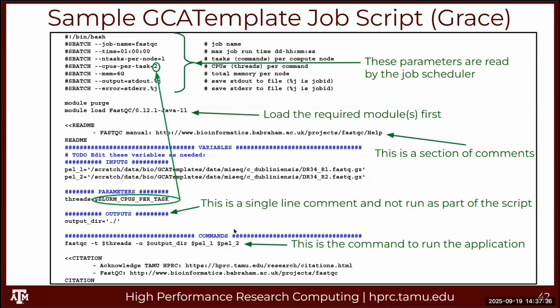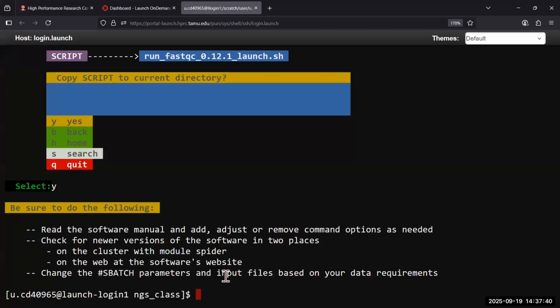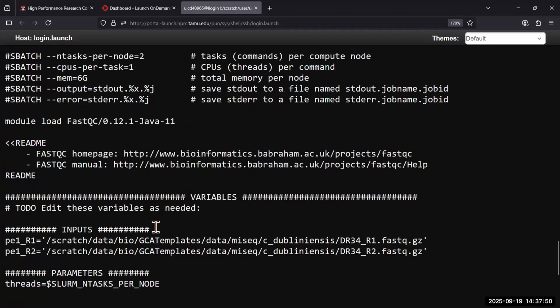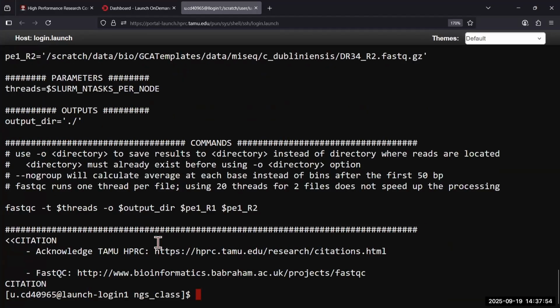All right. So now from here, you can do cat, type in RU and hit tab. It's going to complete the name for you. What cat does is it prints the contents of the file to the screen. Now, if the file is really big, like 2 gigabytes, you don't want to print it to the screen because it's just going to scroll and scroll. Then you have to hit Control-C and it will eventually stop.